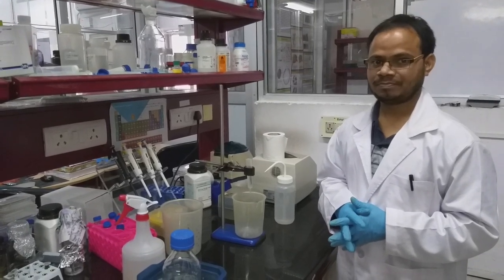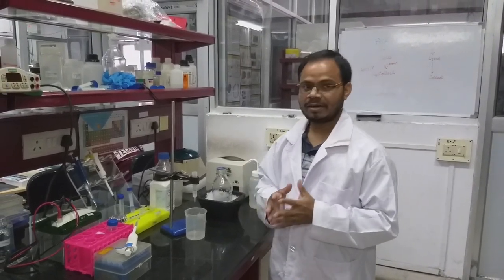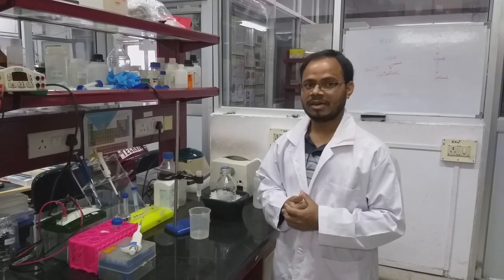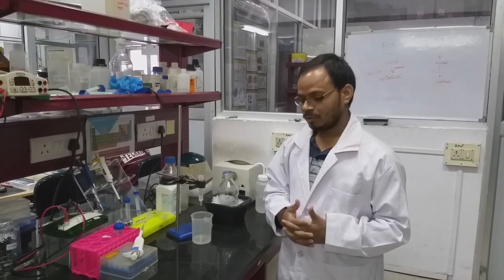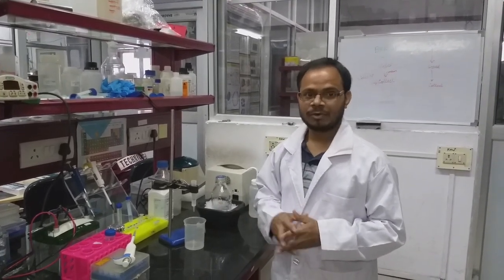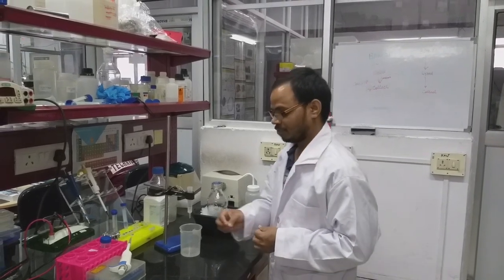the buffer which we used for the lysis of the bacterial cells. Before equilibration of the column, we have to charge the column. Nickel NTA, there are two types of beads. One is already readily charged beads which come from the company, and another one we have to charge. They will give only NTA agarose beads. So here we will charge the beads with the nickel, and then we will equilibrate. We already washed the column with water and 0.2 normal NaOH, again with water. So now we will equilibrate.